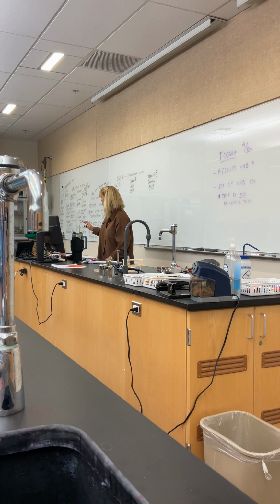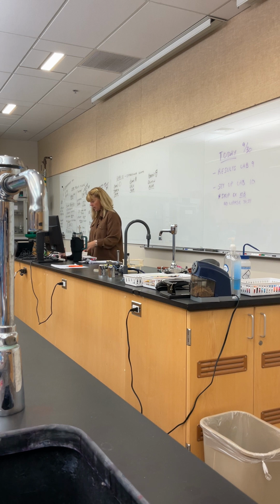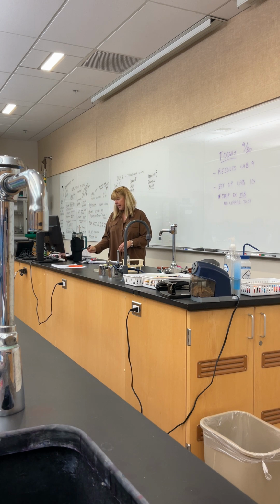And then, like I said, I know it's a lot. It's something you have to kind of sit there and look through. All right? And kind of make sure that you're understanding it. All right, well, let's talk about what we're going to be setting up today. So we're going to be setting up Lab 10.